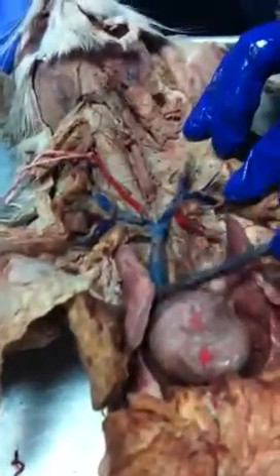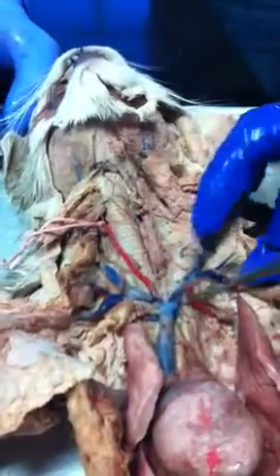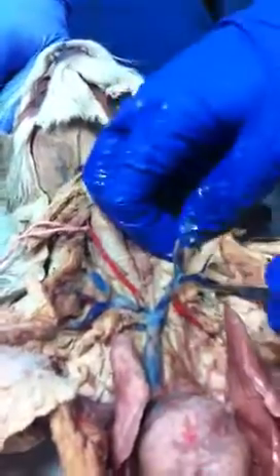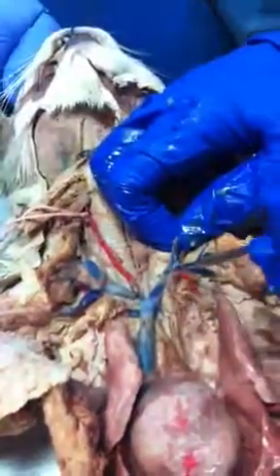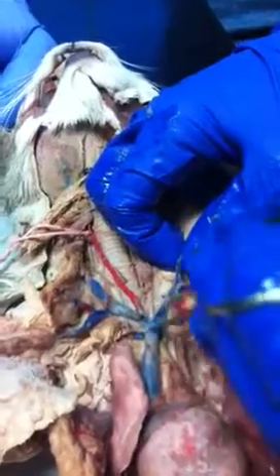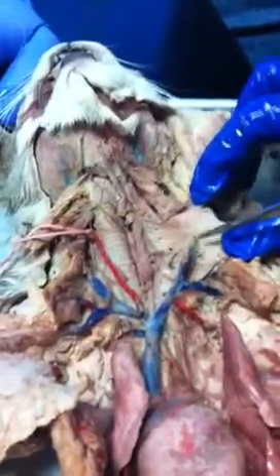Anterior vena cava, formed from the union of two brachiocephalic veins. Each brachiocephalic is formed from the union of a subclavian and a jugular. It's been a long day. Brachiocephalic veins. This is subclavian vein. This is external jugular vein. We do not yet see an internal jugular vein, so you're going to have to make sure you see it on one of the other lab sections.